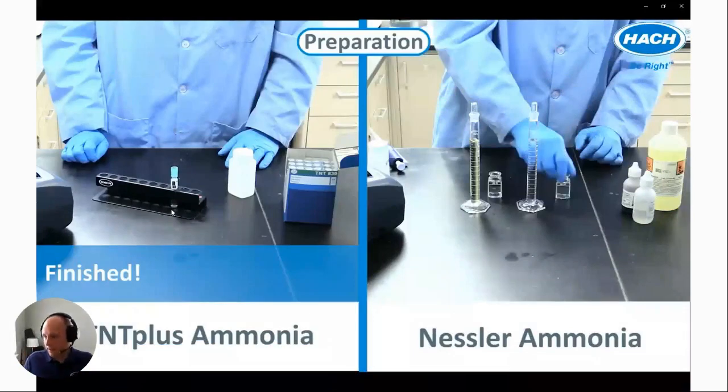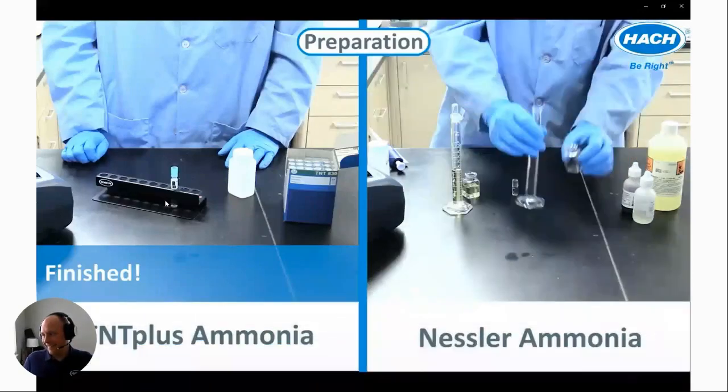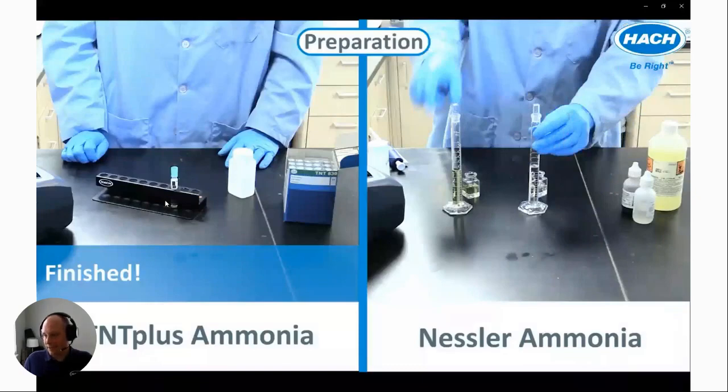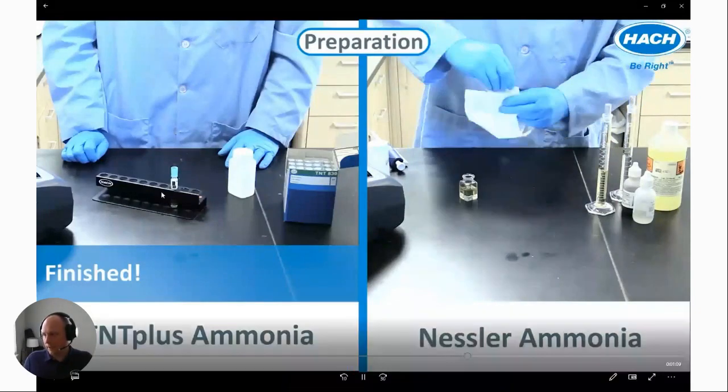So I'm going to transfer these to the two matching cells, and clean these guys off. Make sure I have no fingerprints on there. And then we're going to go and measure in the spec.